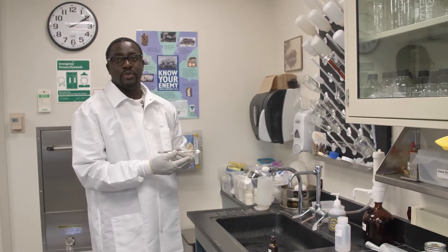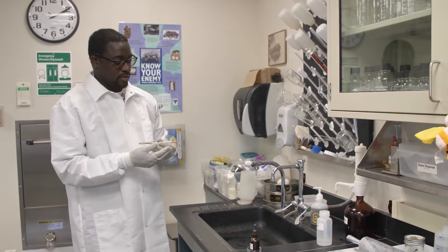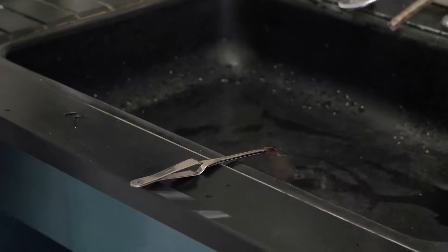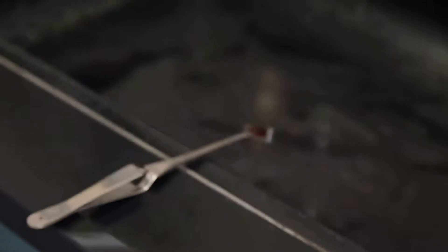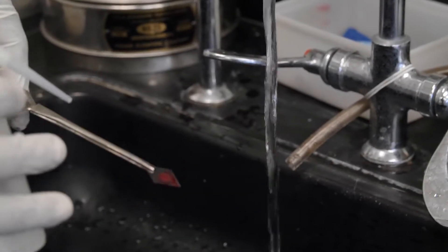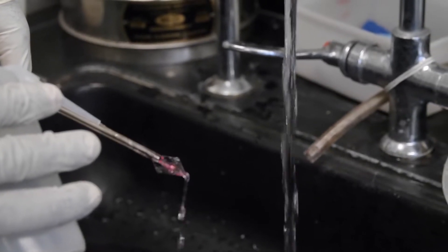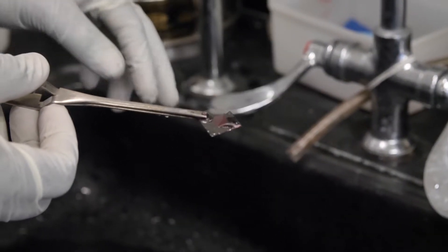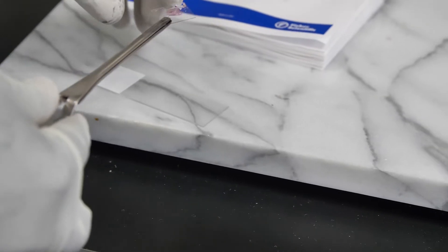Now that we've fixed the remains of the larvae onto the cover slip, we move on to staining. We cover the whole brood material with the dye and wait about 30 seconds to let the dye penetrate the brood. Then we remove the excess stain, carefully running water over the surface without disturbing the fixed bacteria. We then turn it over and transfer it onto the slide, making sure not to move it once it's in place.